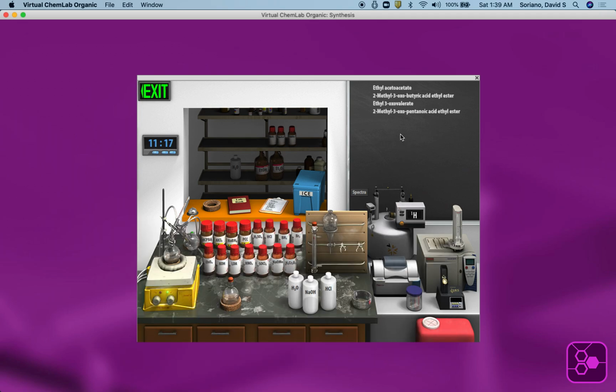And of course we can just look at the ethyl acetoacetate. There's the other product, the second, the third, and the fourth. So I'm not going to do proton NMR or C13. Do you see I just changed it to C13. We're not going to do that, or mass spec. You can even do melting points with solids. But you get a rough idea how this works.